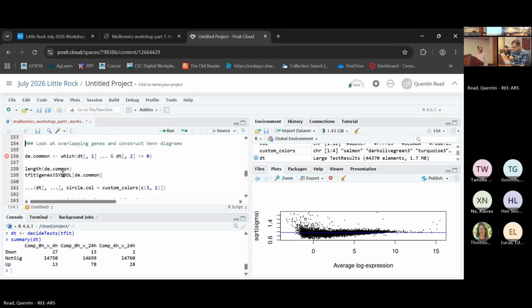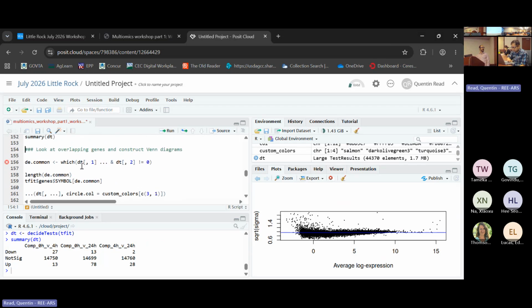So the remaining, I believe, let me just look at the code here real quick. See what we have left. Yes, I think in the interest of time, I will not do the live coding part for the rest of this, because this is just kind of like making different figures, and understanding the exact code of how that works is not that important for learning purposes.